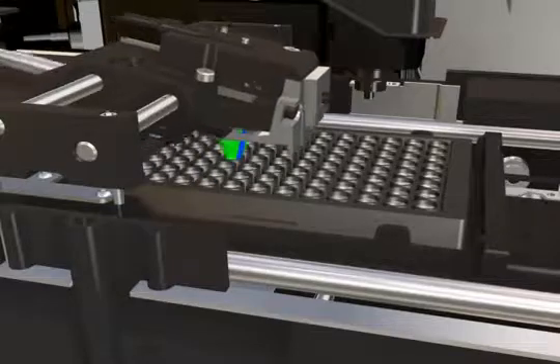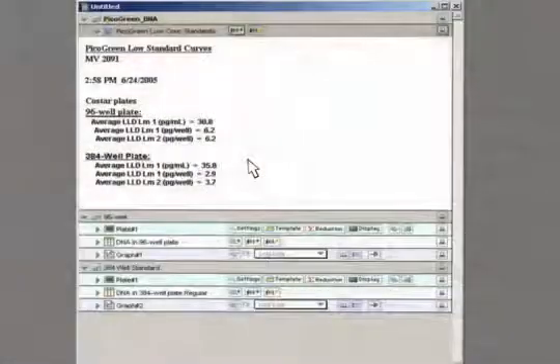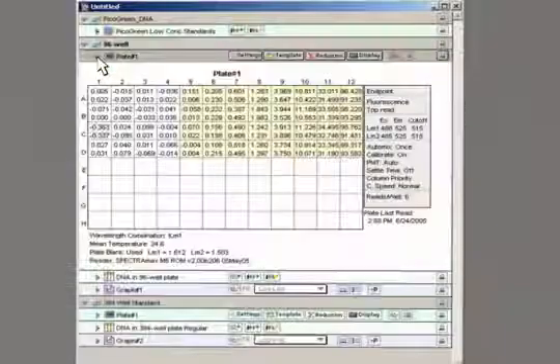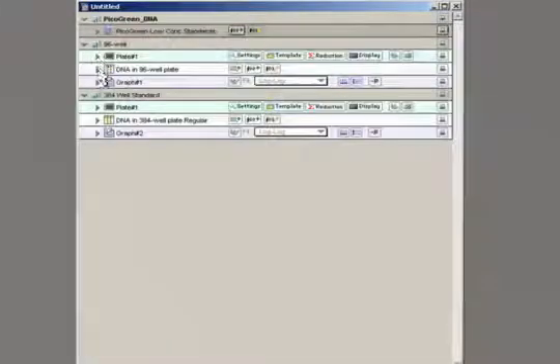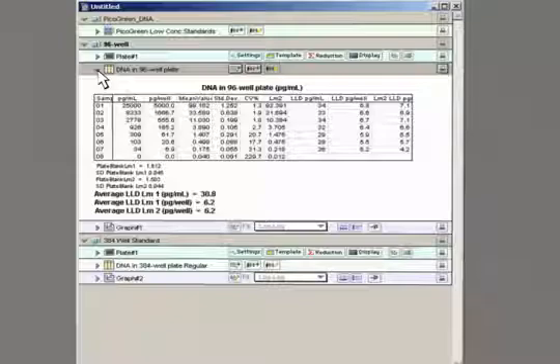We can now read our plate with our proper settings. Once the plate is read, the data is processed in Softmax Pro. Here you see some data summaries. In the plate section window of Softmax Pro, you can organize the data in the plates into different group types and display the instrument settings. All of your data analysis settings are presented in one easy-to-navigate environment.